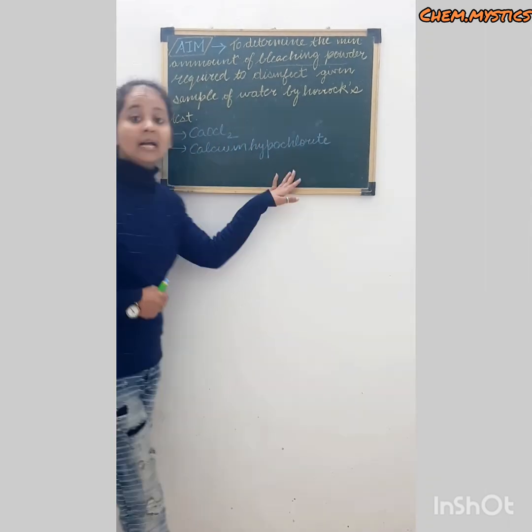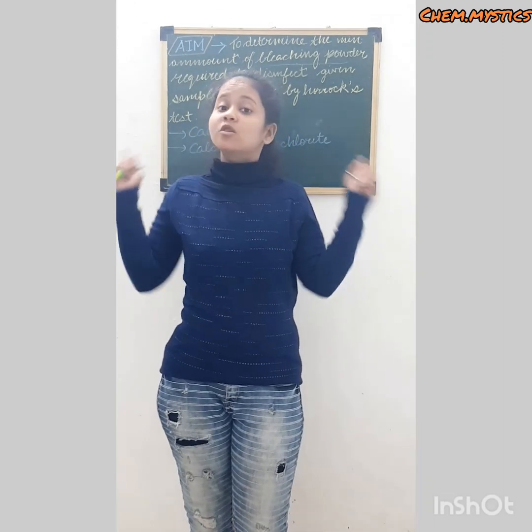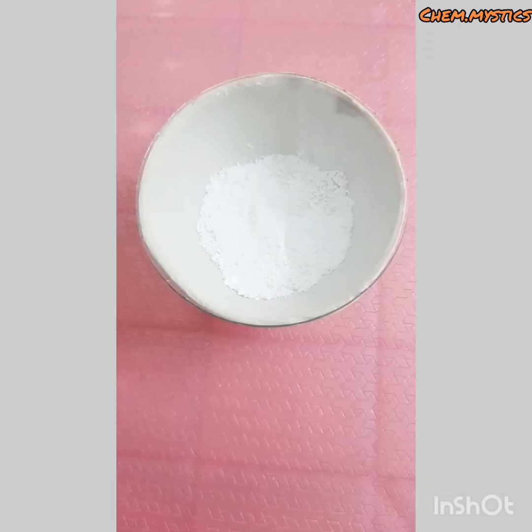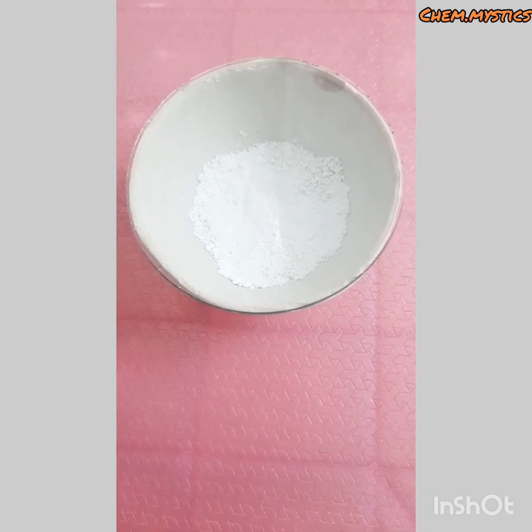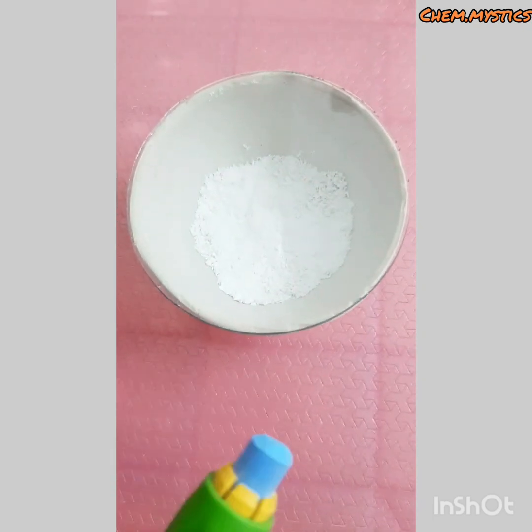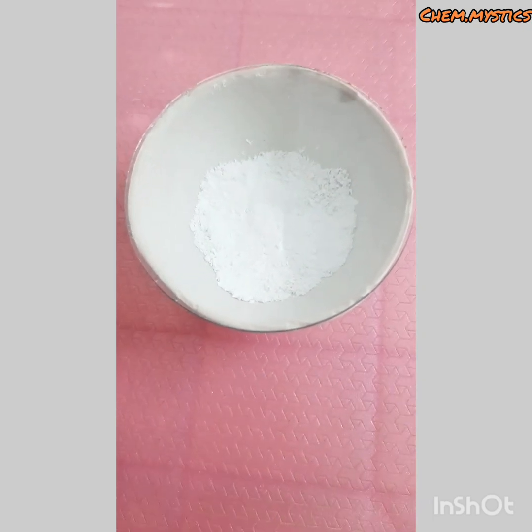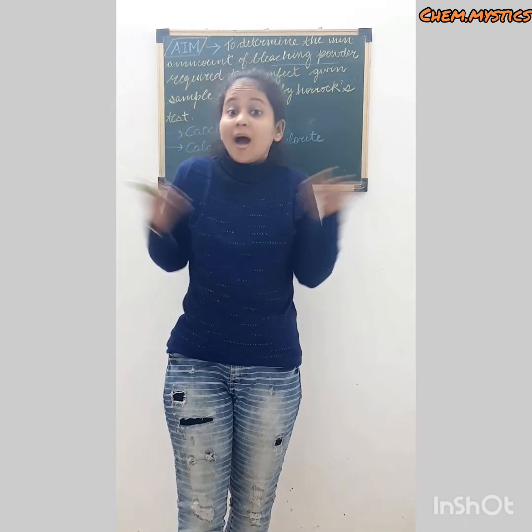Now let me tell you how bleaching powder looks. So have a look, guys. This is a white colored powder having a pungent smell. Yes, this white colored powder is nothing but the bleaching powder. This bleaching powder is stored in airtight containers. Now, why is it so?